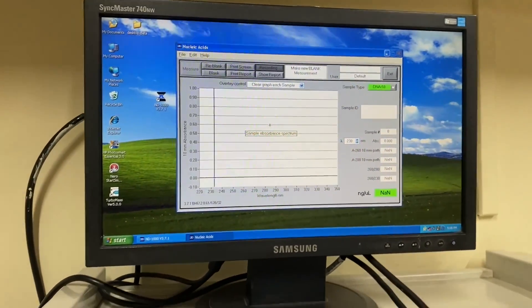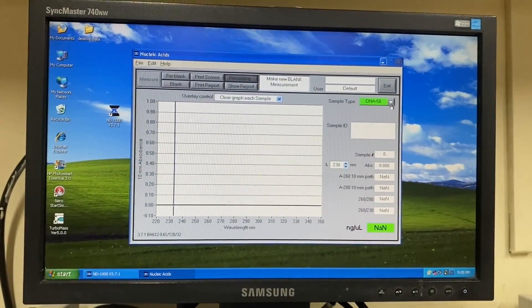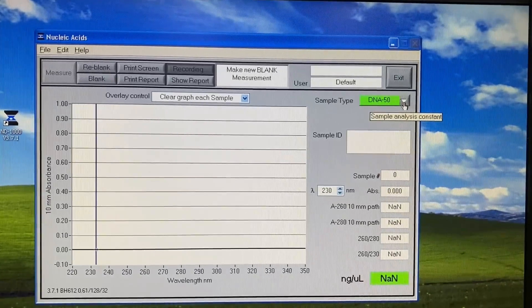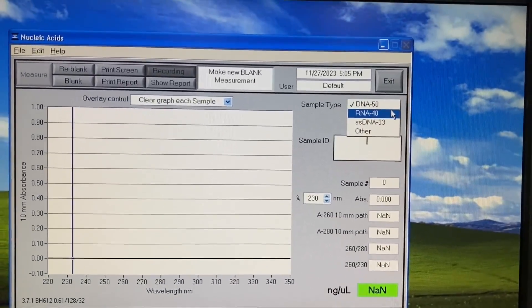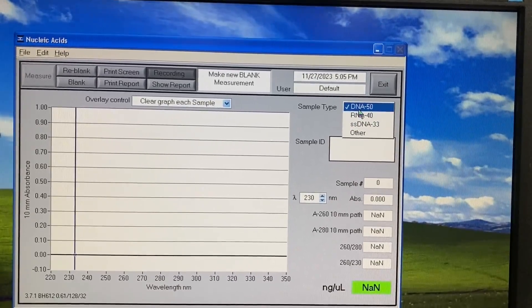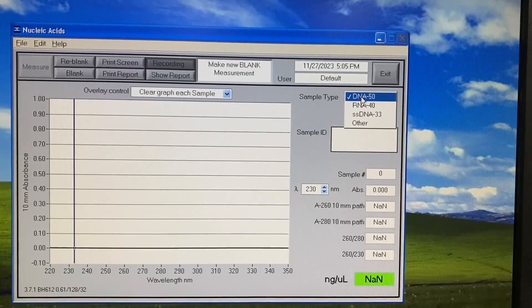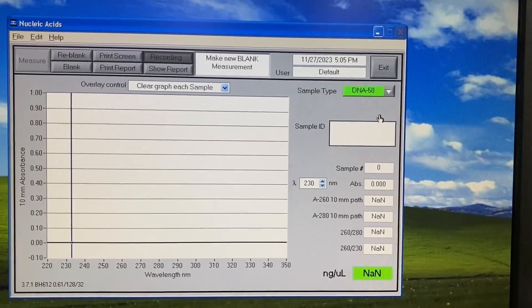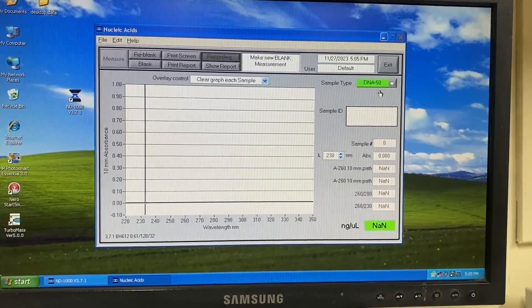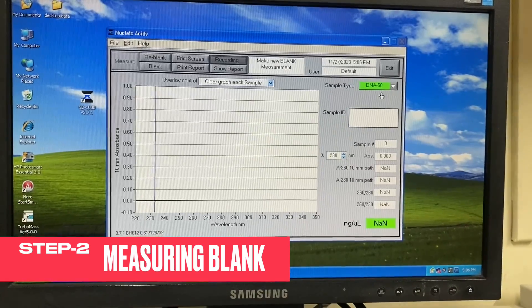After initializing the spectrophotometer, we will see different sample types for nucleic acid quantification: DNA, RNA, and single-stranded DNA. Today I am showing how to measure double-stranded DNA, so I am keeping it on DNA. After that, we have to correct the baseline. We will measure the blank — the solution in which we have dissolved our nucleic acid, that is the DNA.